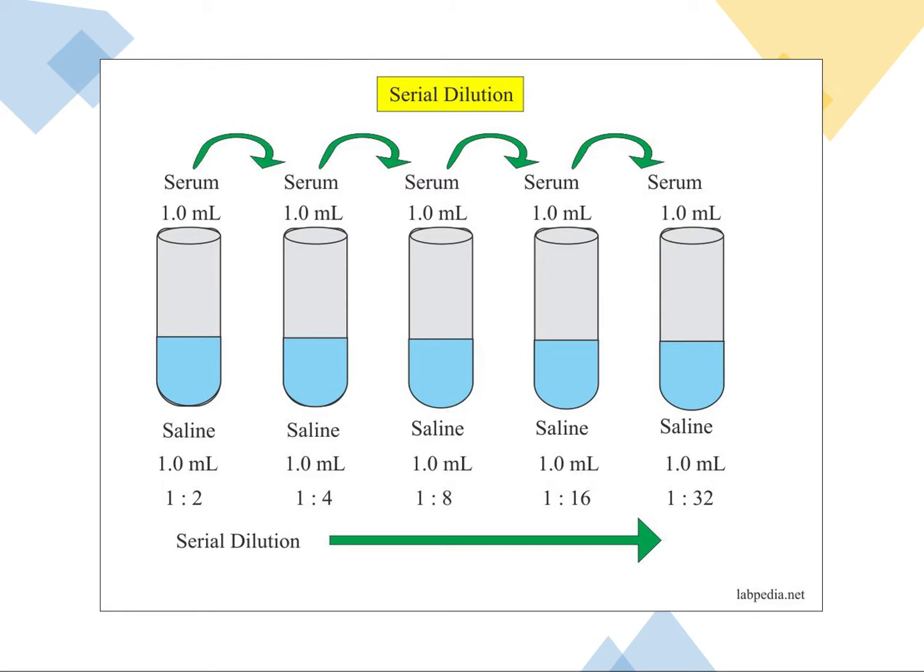So you can either draw these or you can use your test tube papers that I think are in your packet. But what I do is I draw them out and I draw my test tubes, and then I draw how much is in each test tube. So in this test tube there's 1 milliliter of saline, so all of these have 1 milliliter of saline because this is a serial dilution, they're all the same. And then you're going to pipette 1 milliliter of serum into the first tube. You're going to mix it up.